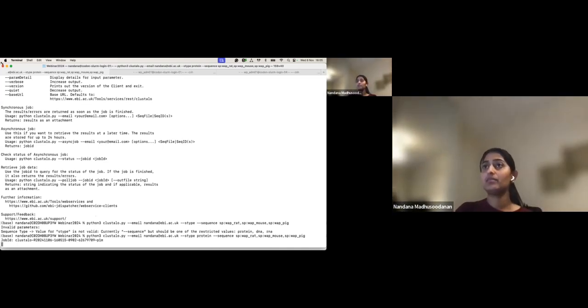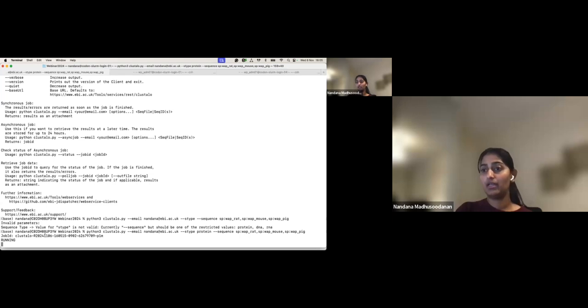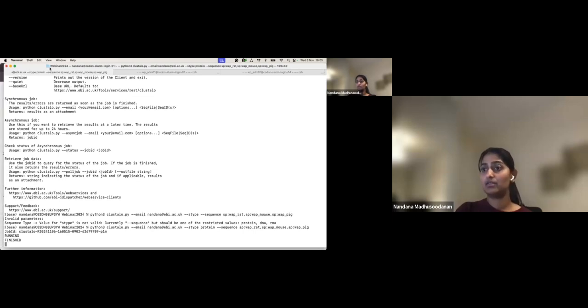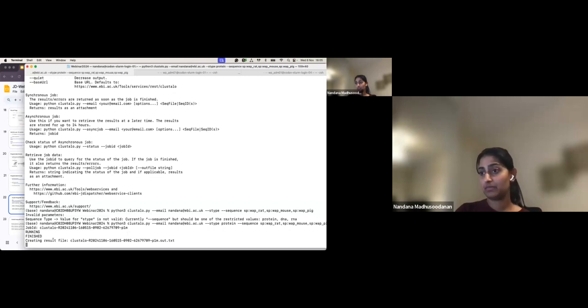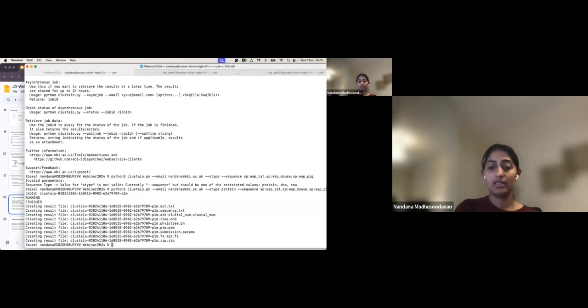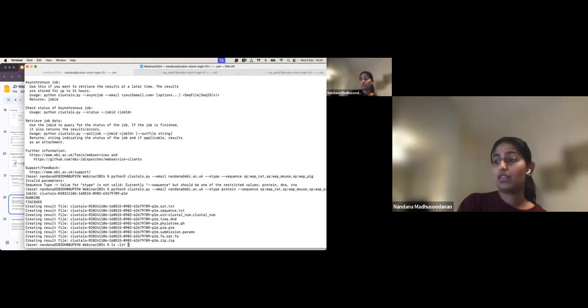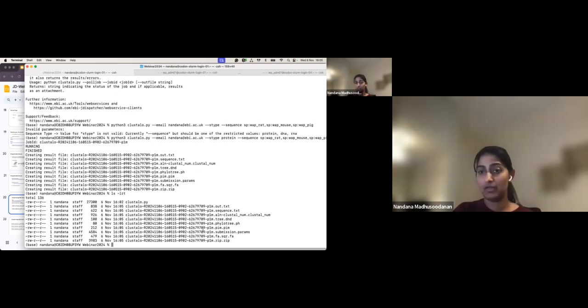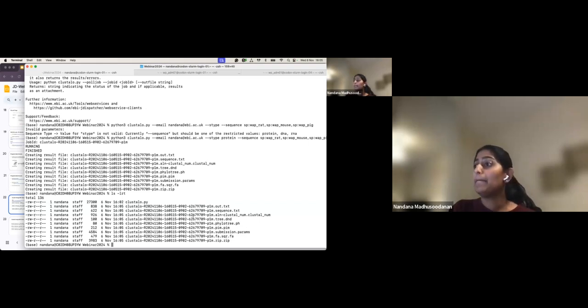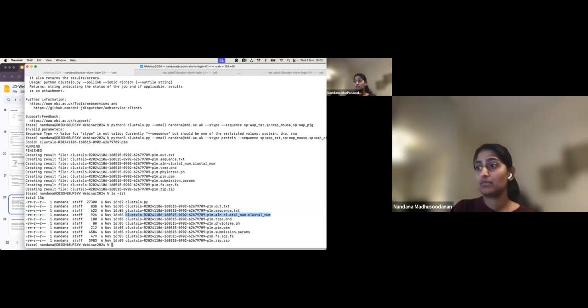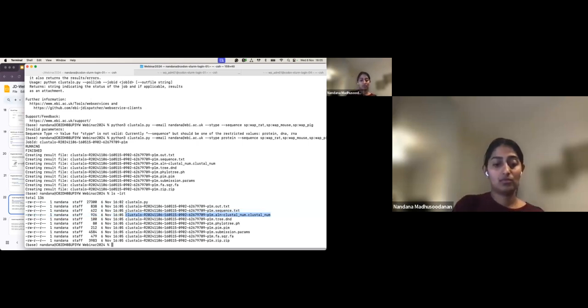Now with the sequence type set to protein, the job submits successfully. I get the job ID, the status shows it running and then finished, and the result files are downloaded automatically. If I list the files I can see all the result files have been downloaded.